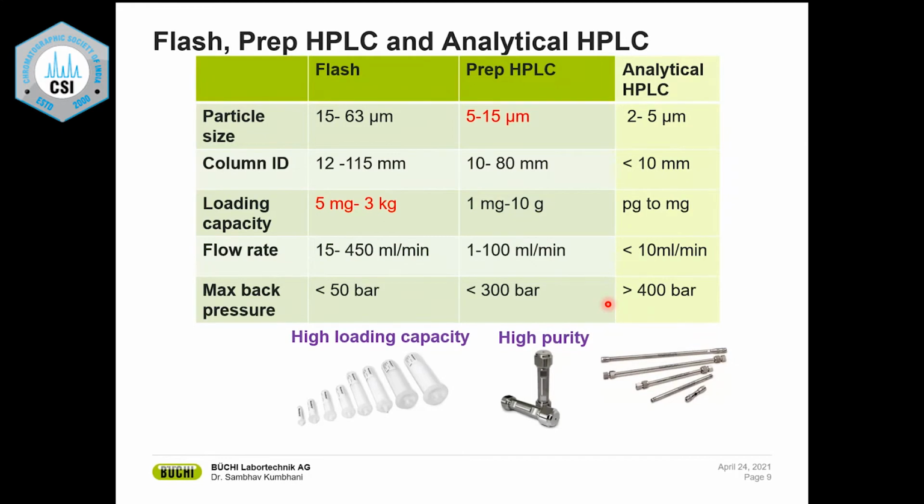And then finally take the same diameter column and fill it up with extremely fine sand and dirt, and pack it really tightly. Now pour water on top. It will take really long for that water to come down, because now the sand is offering a huge resistance for that mobile phase to come down. This resistance offered by the stationary phase, or the packing of your column, is measured in terms of pressure, and we call it back pressure.